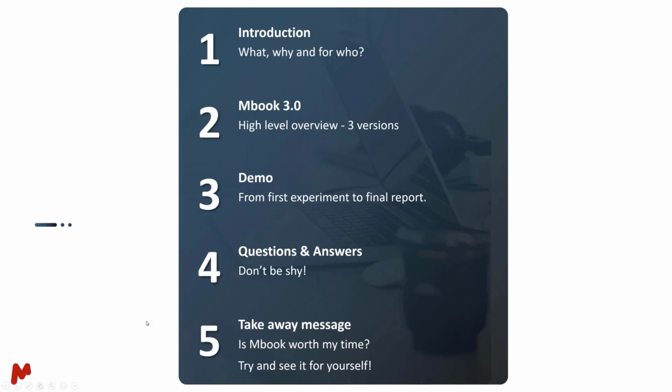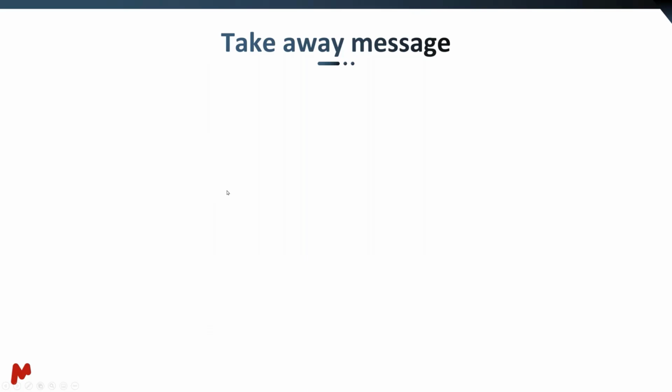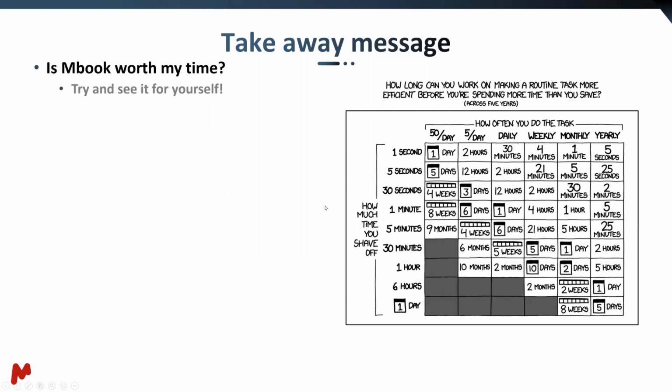Let's start with the takeaway message, which is: is Mbook worth my time? And the answer is, try it and see for yourself. It's really easy. There's one way to approach whether it's worth your time or not, and it's how much time you spend and how much time you can save. So let's take a look at a task you are repeating daily, and let's say it takes you 5 minutes a day.